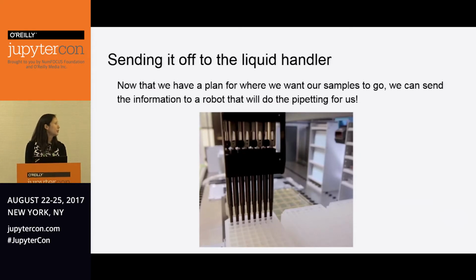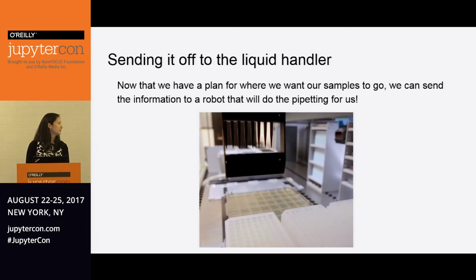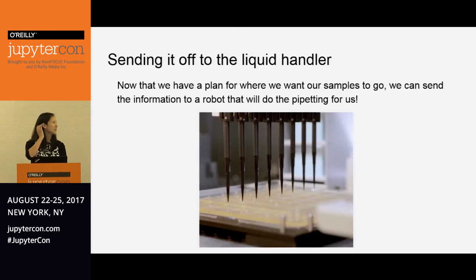So finally, once we have our Hitpick plan, which is the CSV representation of those plates that you just looked at, we are able to send it off to the liquid handling robot that can do the pipetting for us. So this isn't exactly, oh no, will it play? There we go. This isn't exactly Hitpicking per se, but I really wanted to show you what it looks like to have a robot do your pipetting for you.